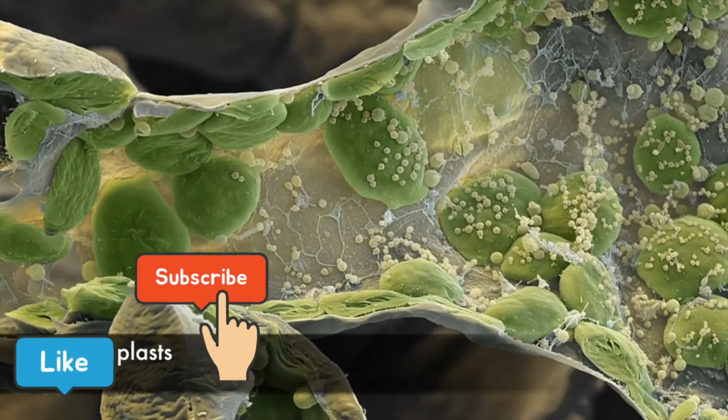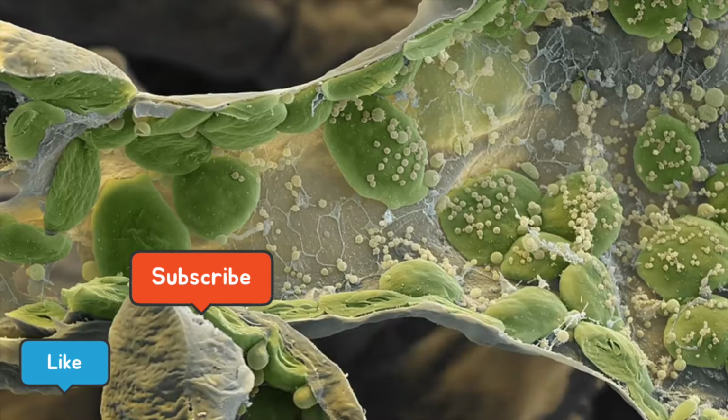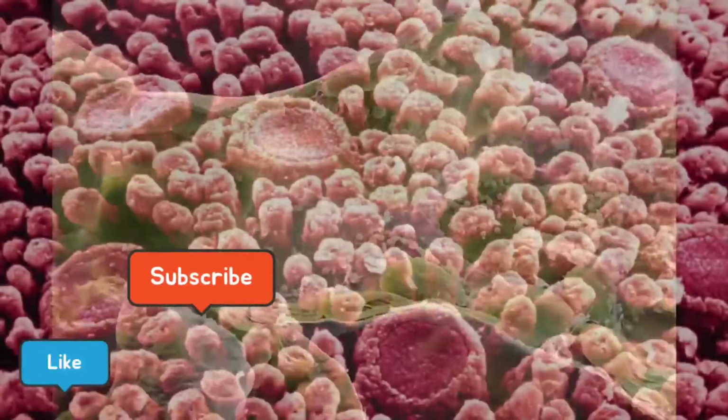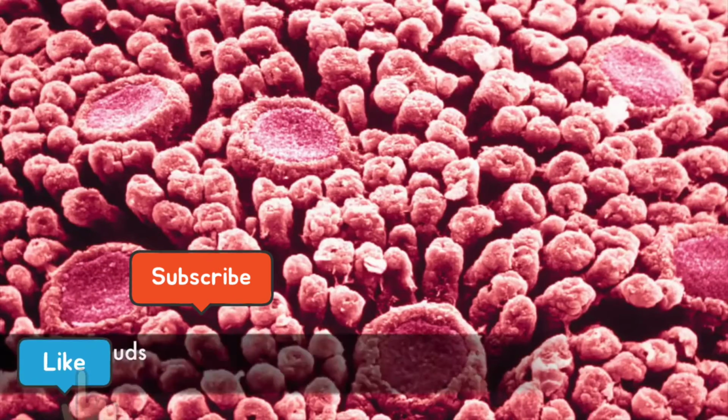These are chloroplasts, the organelles found in plant cells that conduct photosynthesis. The plant seen here is a weed, and the little dots you see on the chloroplasts are herbicide, which blocks one of the main enzymes used in chlorophyll biosynthesis. This puts a stop to photosynthesis, which means no conversion of light to energy. Taste buds on the surface of a human tongue.